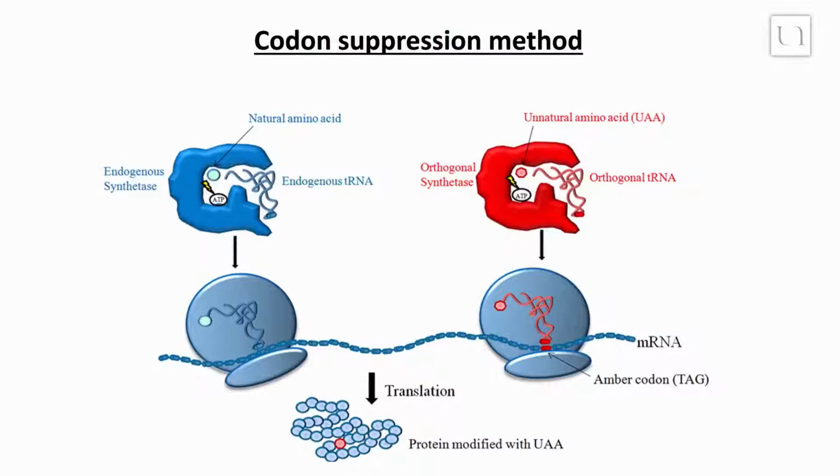Codon suppression methods have emerged as the most popular method to incorporate unnatural amino acids at defined positions. This methodology will be applied here to the production of a protein carrier containing an unnatural amino acid harboring a bioorthogonal functional group. This reactive handle can next be used to specifically and efficiently graft a synthetic oligosaccharide hapten to provide a homogeneous glycoconjugate vaccine.